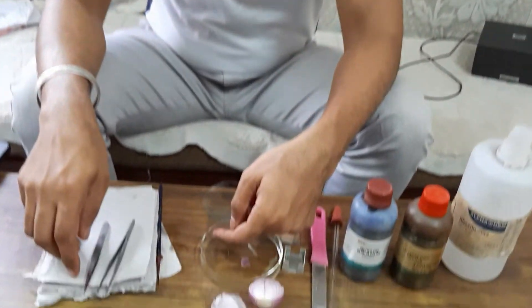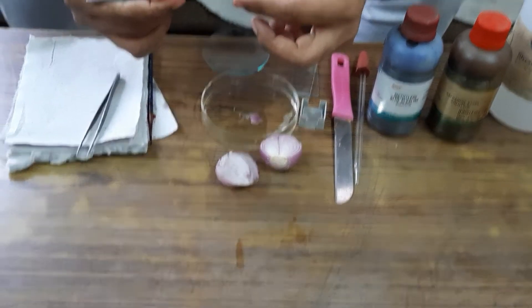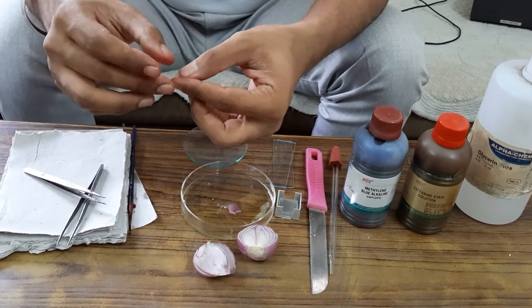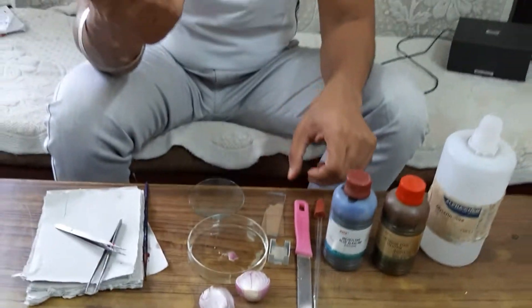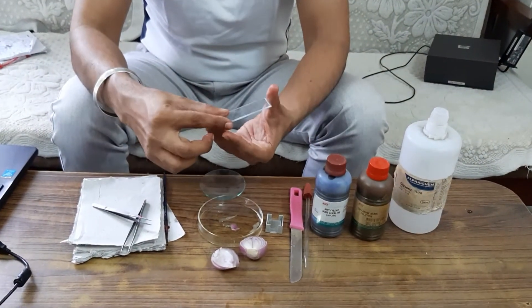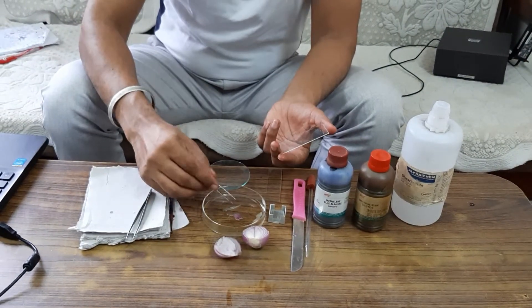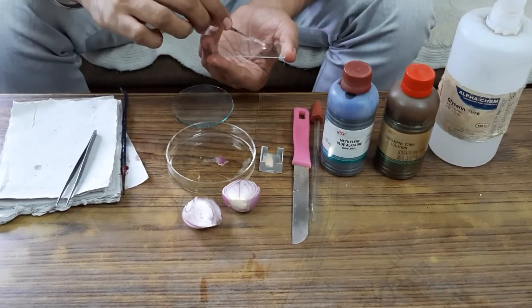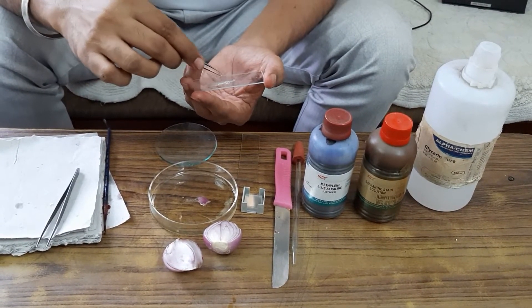Similarly, I have taken some more onion peels. The next step is to spread this onion peel on the glass slide. Using the forceps I will shift the onion peel onto the glass slide and spread it.